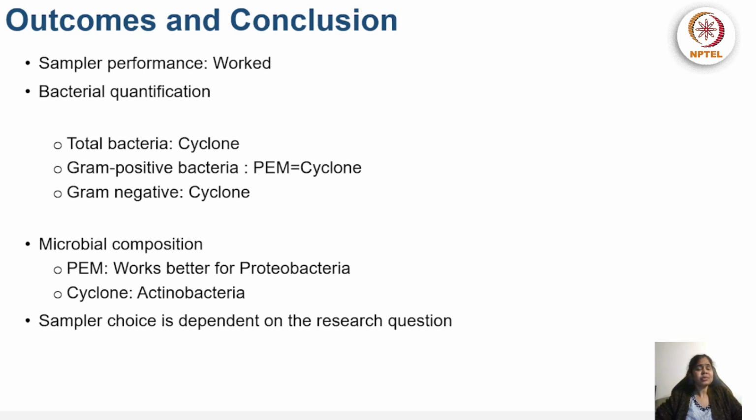Also, there are a lot of different things we have to remember when we choose the analysis. For example, like I mentioned earlier, even in choosing the filter paper, we have to be very careful which filter paper we choose, because each filter paper has a different efficiency in sample collection. And when we analyze that filter paper, again we have to be really careful to digest the whole filter, or make sure that we collect every particle from that filter. So choosing the technique and the sampling for indoor air pollution monitoring is highly research question based. That's what I would like to conclude from this case study.